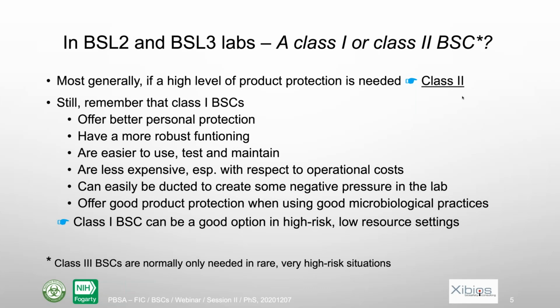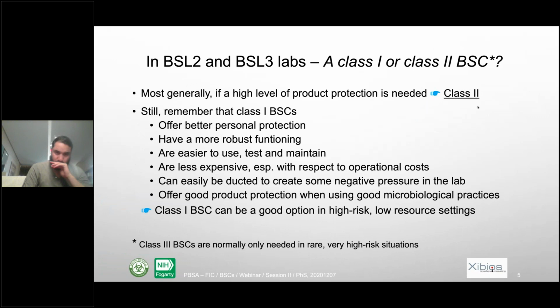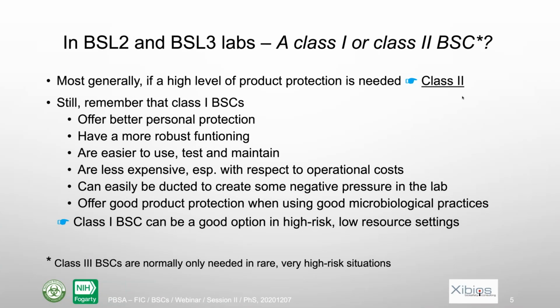And they can still offer some product protection. They are not designed for that, but if you use good microbiological practices, good microbiology techniques, you can reach a quite good level of product protection. So even if class 2 biosafety cabinets are the ones which are most generally used if we need some product protection, class 1 biosafety cabinets can also be a good option, especially if there is a high level of risk, and especially if you don't have many resources to purchase the equipment, but also to maintain it after that.